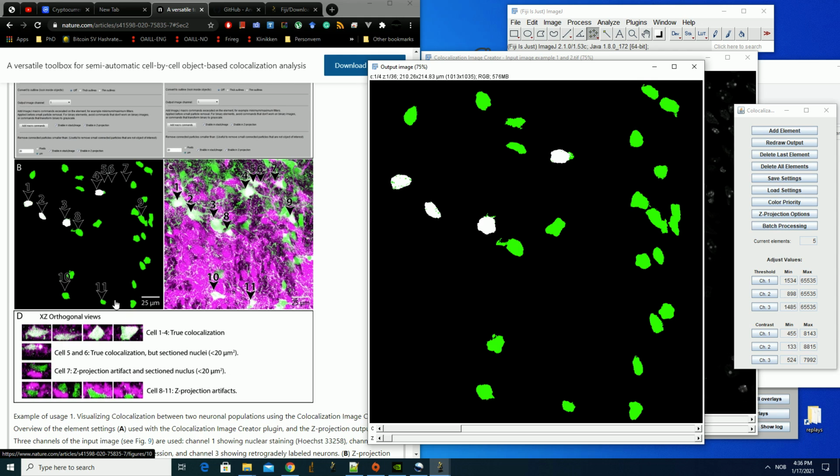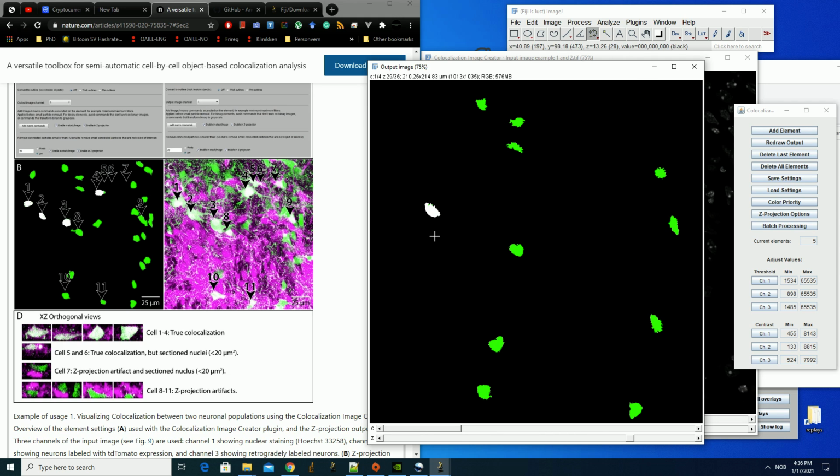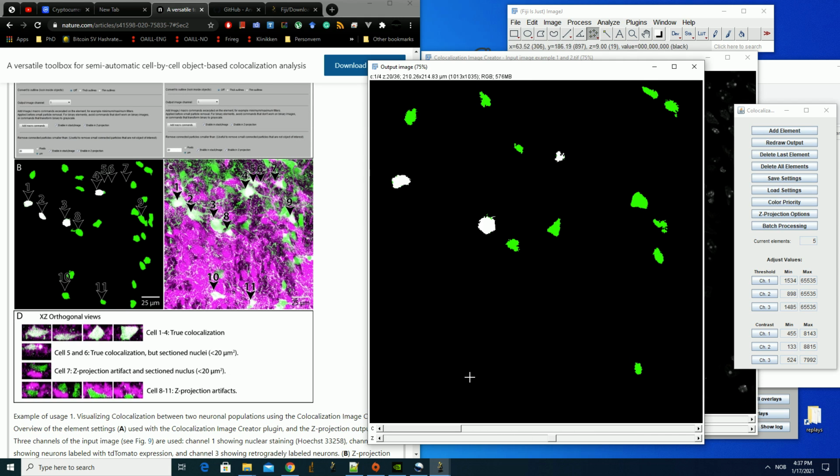So just to remember again that what you see in the top set projection here, if you use binary signals, you can be sure that these are not representing any overlap from stacked cells, because the binary signals are only coming from single locations here. So if you have stacked cells like this number 10, it will only show one of the signals, and this is just one example.